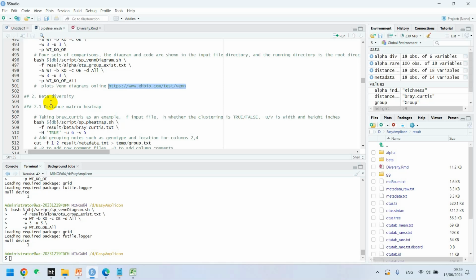In the field of metagenomics, scatter plots are commonly used to display beta diversity between sample groups. Common analysis methods include principal coordinate analysis, principal component analysis and constrained canonical PCoA. While reading articles, you often come across terms like PCA, PCoA, NMDS, CPCoA, CCA, RDA, LDA. Essentially, they are all forms of ordination analysis.